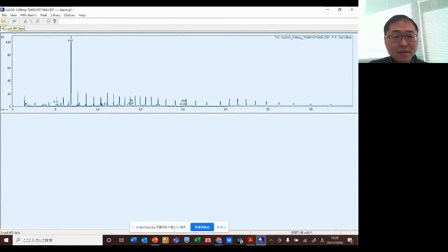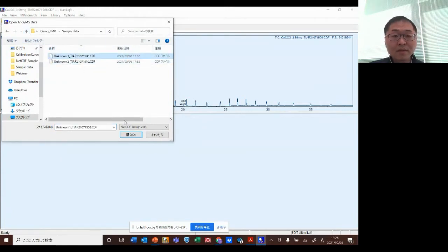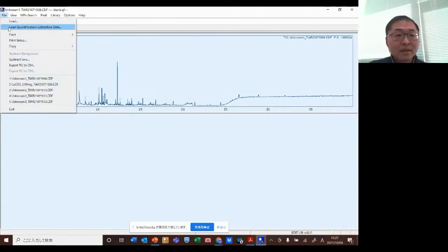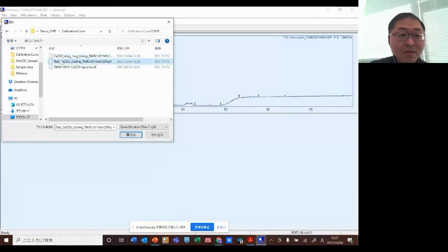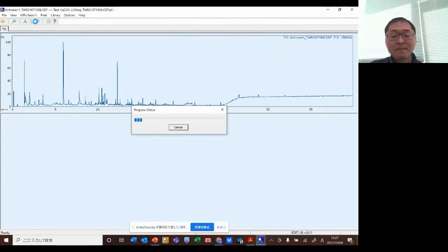So next, let's analyze an environmental sample. All right, so you go to sample data. Let's say I upload this unknown sample. Okay, then next I upload the calibration table I just saved, test. Okay. Then go to the menu bar and click search microplastics.